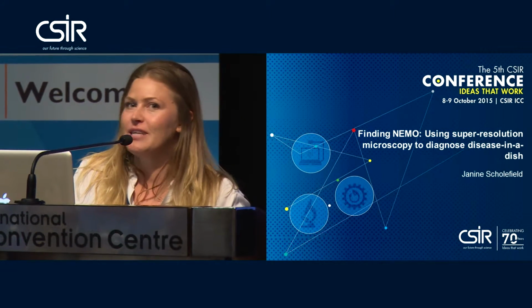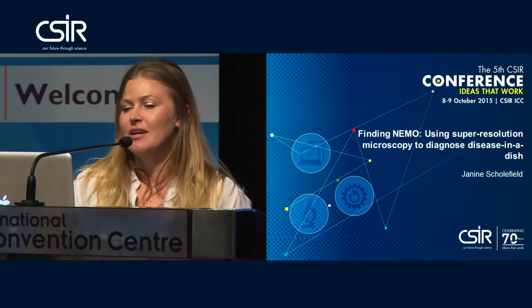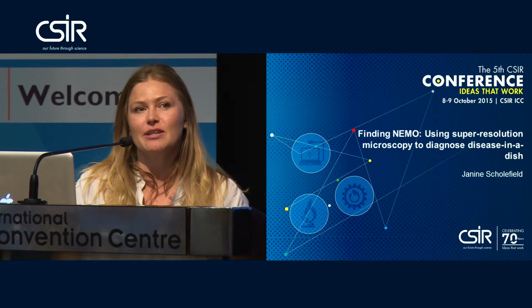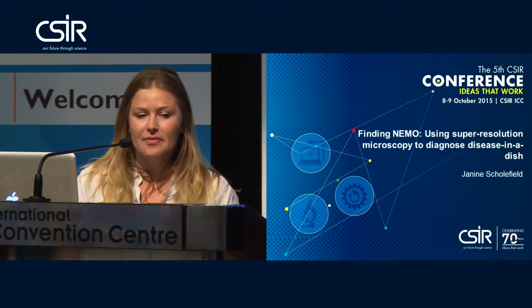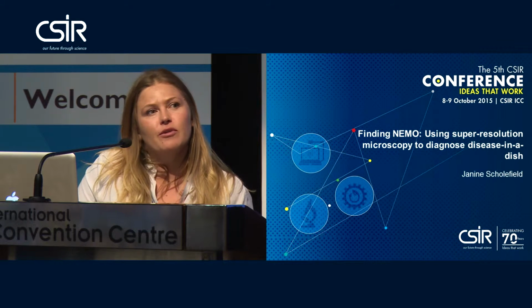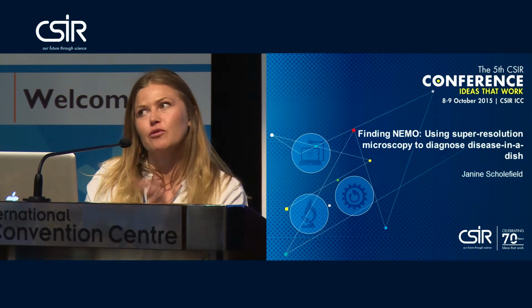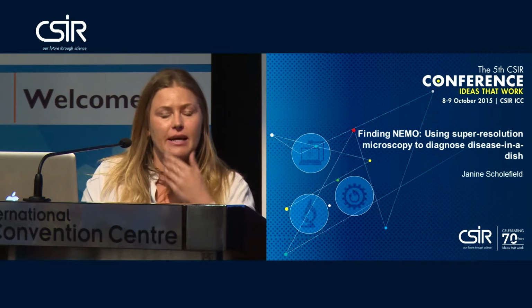I'm going to talk to you today about a little project we've been working on for the last few years called Finding NEMO, and how we have used super resolution to, in essence, diagnose disease in a dish. But before I launch into the talk proper, I think it's important to place the work that I'm going to talk to you about in the context of the research that our lab does.